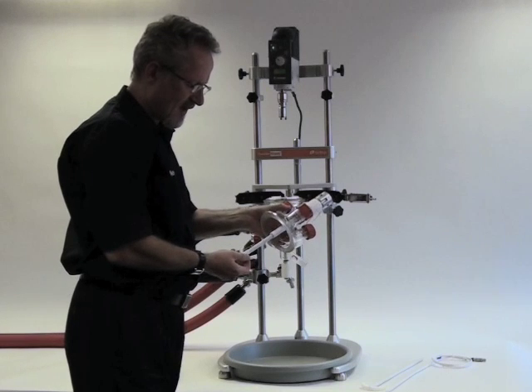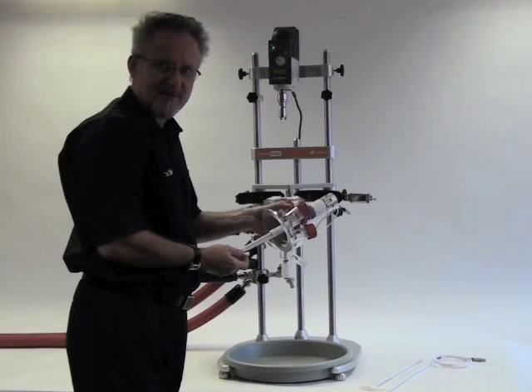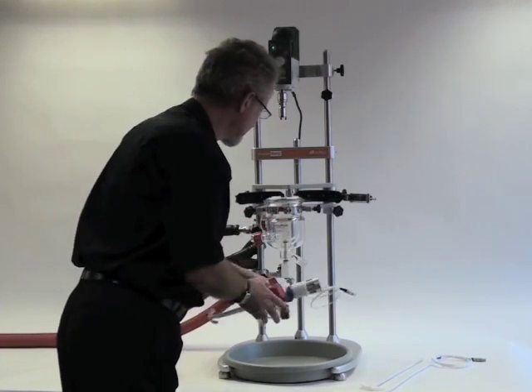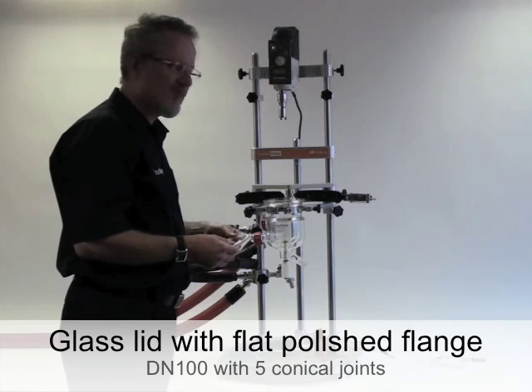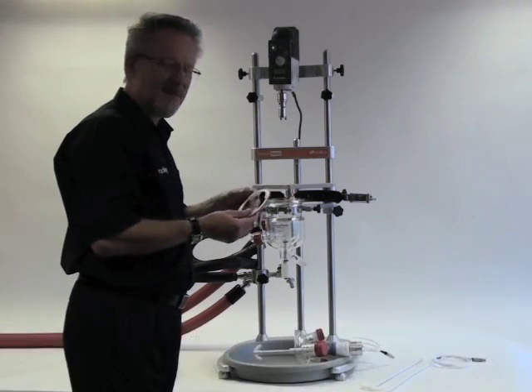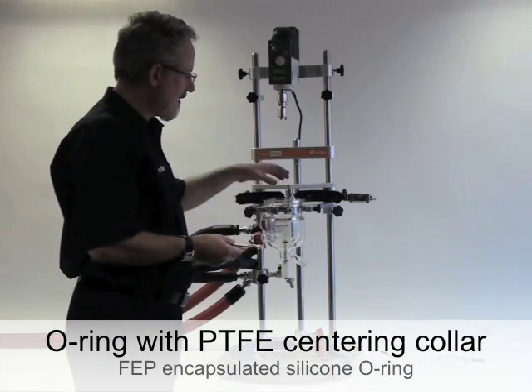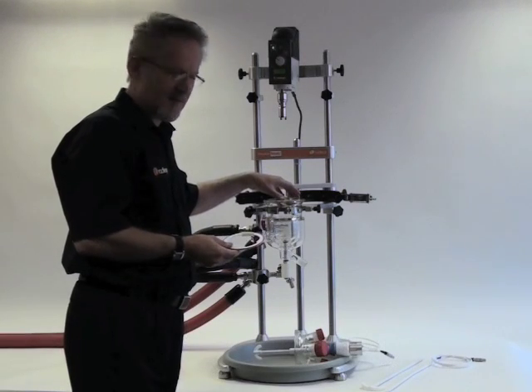As standard, we offer an anchor stirrer shaft, and also available are our retreat curve impeller and pitch blade turbine. With Reactor Ready, we're using a flat polished flange and an FEP encapsulated O-ring which is centred by this PTFE collar. The flat flange makes it much easier to obtain a very good lid seal.